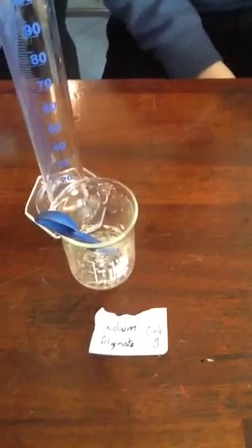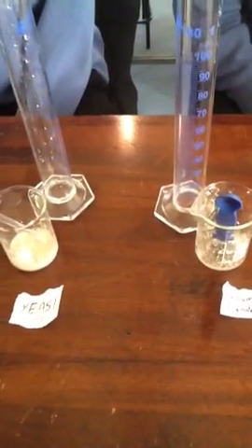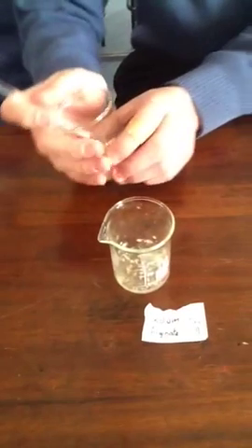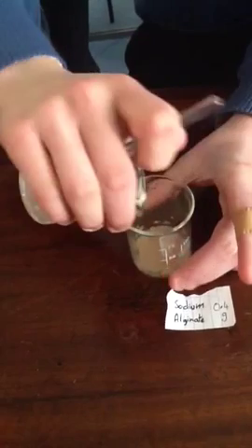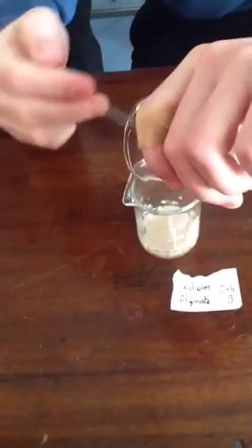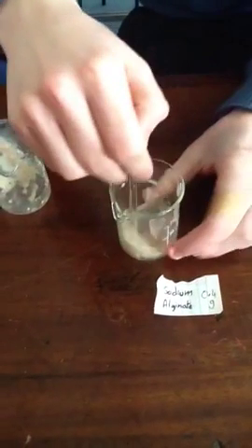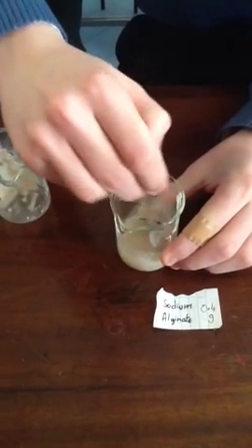Oisin, you have dissolved the sodium alginate and we have the yeast dissolved here. So what are we going to do with these two solutions now? We're going to mix them together. Will you add the yeast into the sodium alginate, please? That's looking very well now.